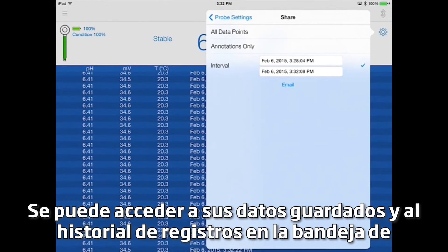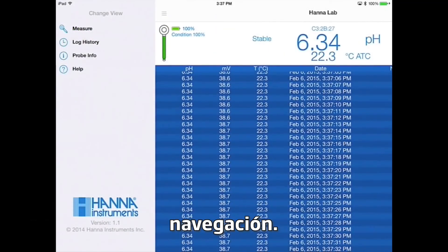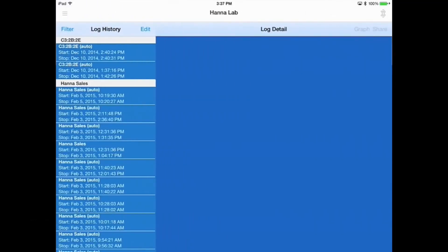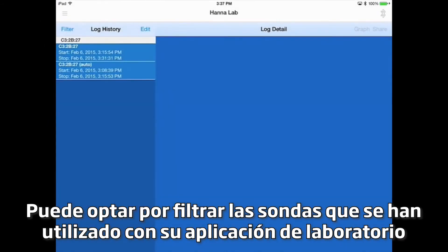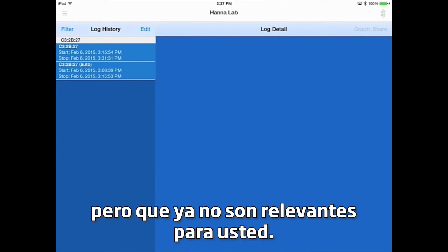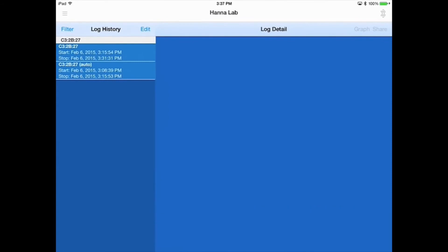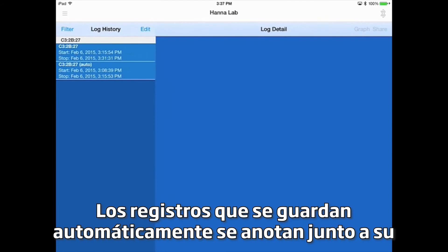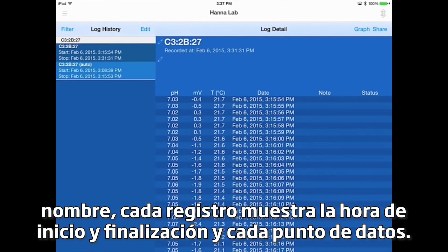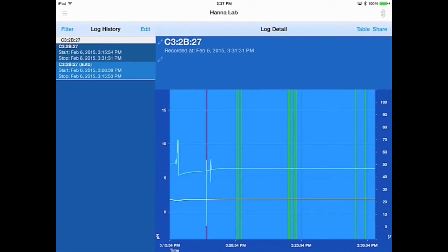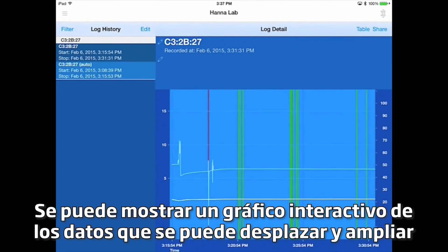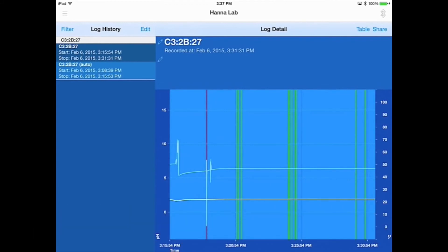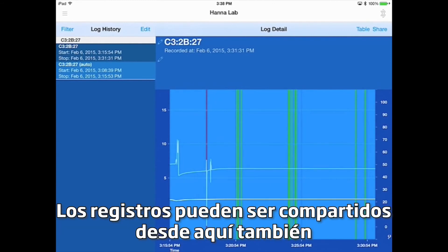Your saved data and log history can be accessed in the navigation tray. You can elect to filter out any probes that have been used with your lab app but are no longer relevant to you. Logs that are automatically saved are noted next to their name. Each log displays the starting and ending time and each data point. An interactive graph of the data that can be panned and zoomed can be displayed for enhanced viewing.